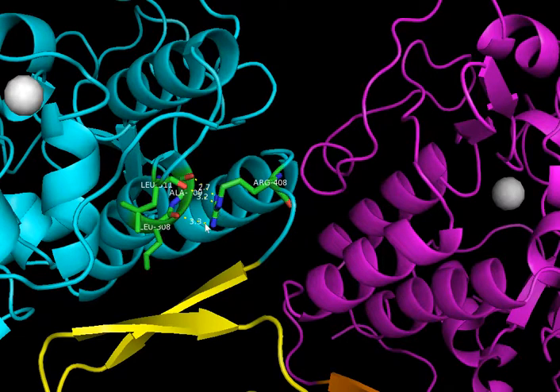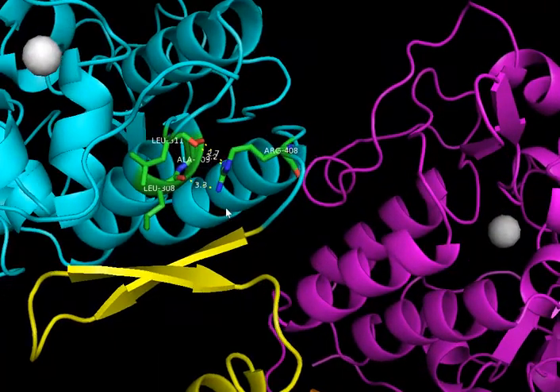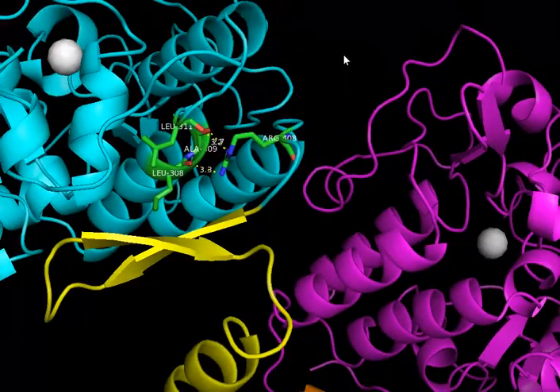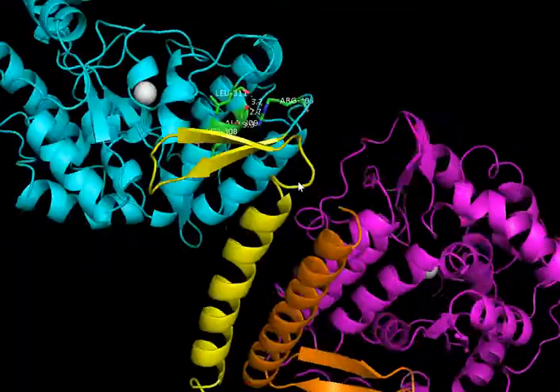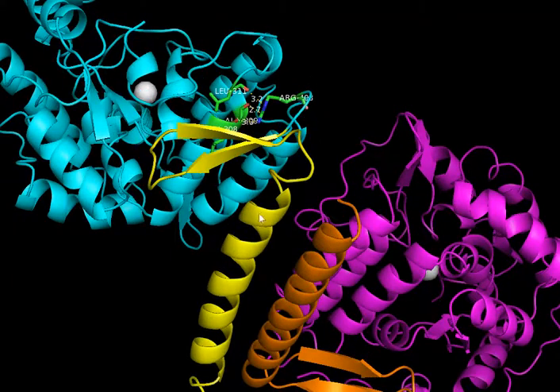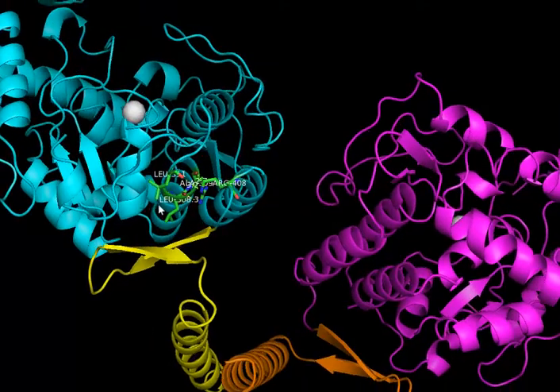In this case, what these hydrogen bond links do is that effectively they hold the catalytic domain in blue against the oligomerization domain in yellow. They do this in a specific manner which orientates the oligomerization domain of this subunit against the oligomerization domain of another neighboring subunit, shown here in orange, and this promotes formation of the tetrameric structure.